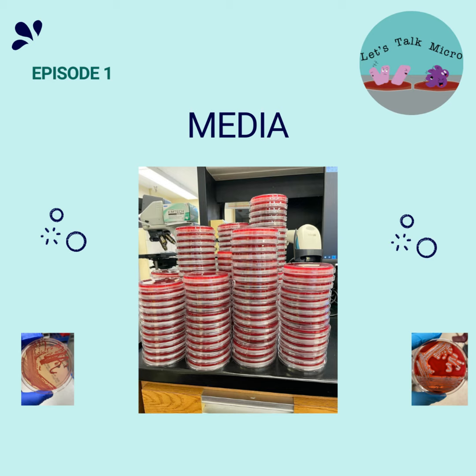And then we also have selective agar and differential agar. Selective agar has one or more agents that inhibit the growth of certain organisms while selecting others. That's just what it is. Two classic examples are PEA and MacConkey, right? MacConkey has those bile salts that inhibit the growth of gram-positive organisms, so it selects for gram-negative rods.